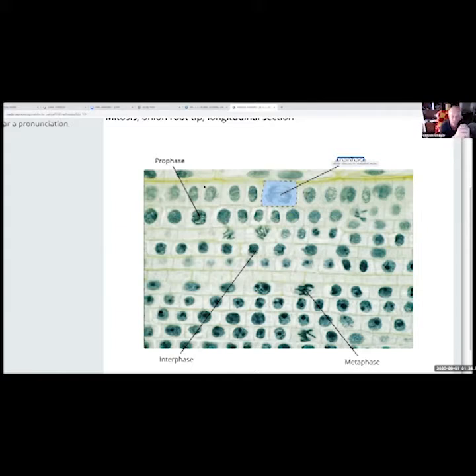And you start to see that. That's your prophase. Metaphase is when they line up into the center. This blue one right here. You can see how all the chromosomes are starting to line up. Okay. And right into the center so they can be split apart. And anaphase, you can see it actually starting to split apart right there. And does anybody see a telophase?